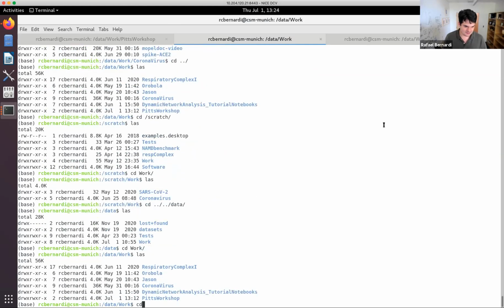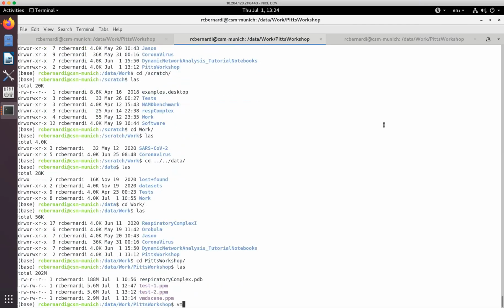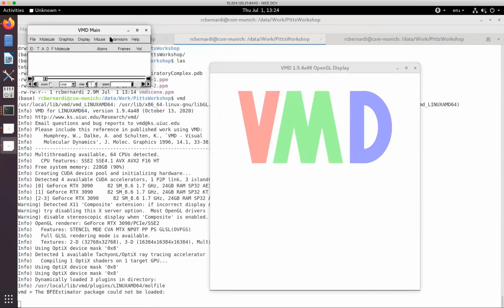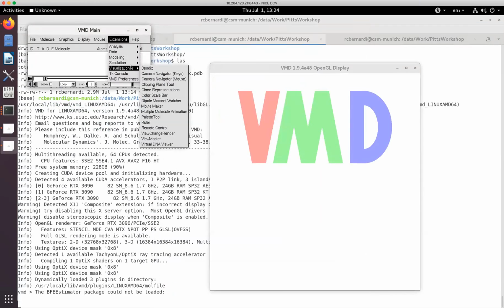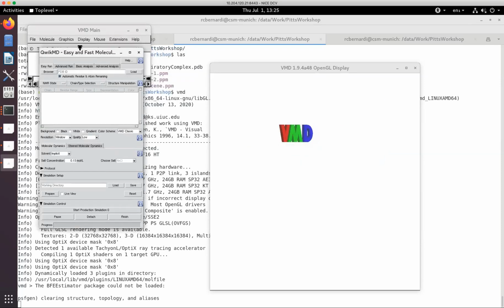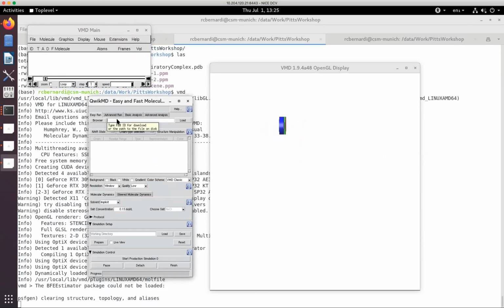Actually, I was going to mention one other thing. In Rafael's demo, he made a very good point about matching the VMD color scale when you're doing a plot, like with MATLAB or something else, and you want to use the same colors. I should point out that both for MATLAB and Python Matplotlib, we have scripts for VMD that will make the VMD color scales exactly match those used in these other tools. That way, if you're rendering a figure and you want to color the structure with exactly the same color ramp that you used in a plot, that's very easy to do.